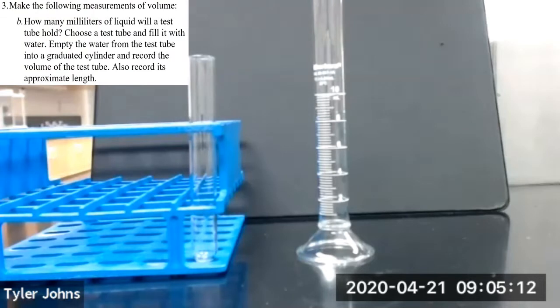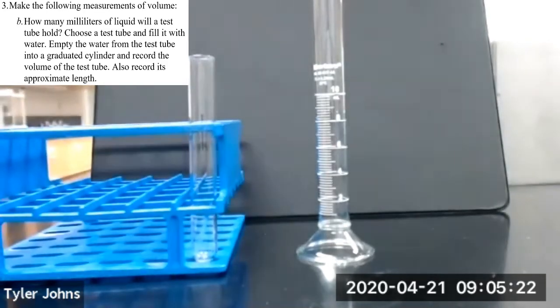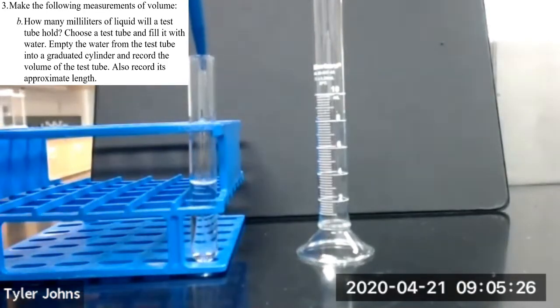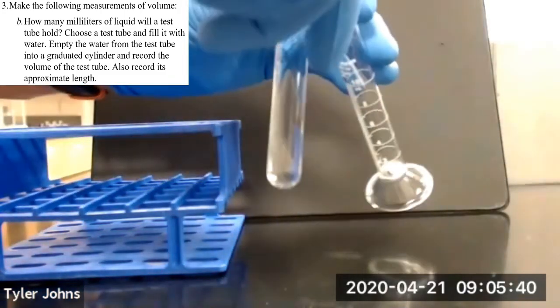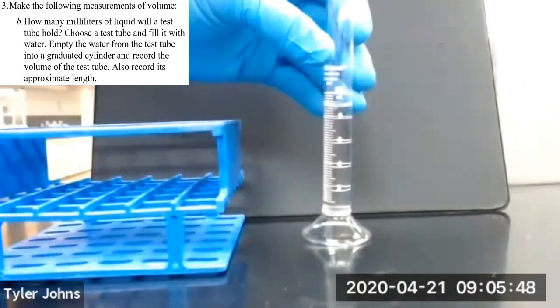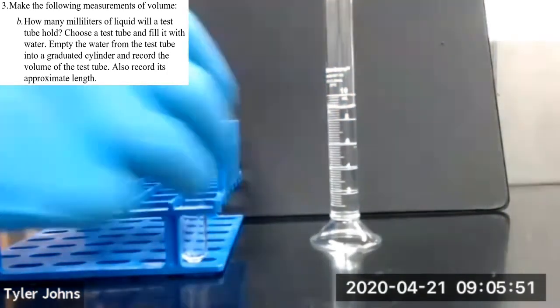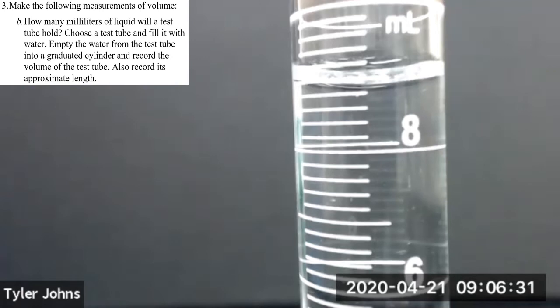Okay, so for part B of number 3 of this experiment, we are going to determine how many milliliters of water this test tube will hold. So we're first going to fill our test tube with deionized water. And we're going to transfer the water in our test tube to our 10 ml graduated cylinder. And now we'll zoom in. That is how many milliliters of water was in our test tube.